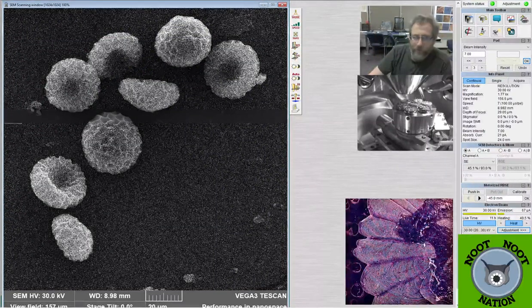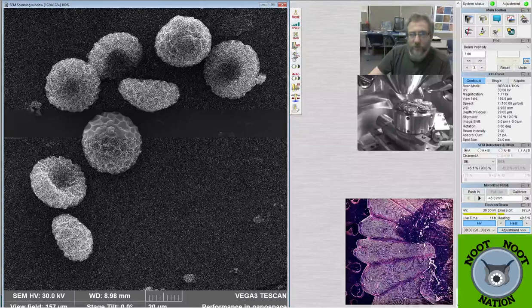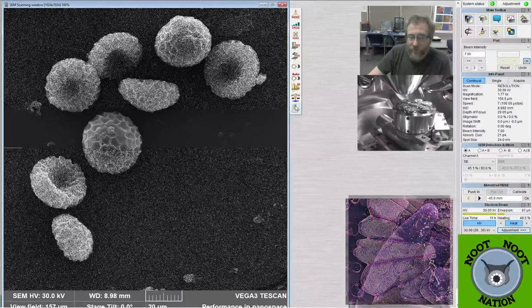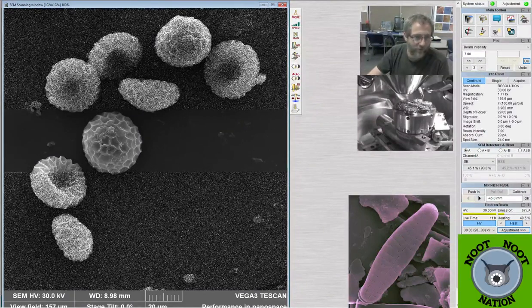For diatoms, I usually operate at like 5 or 4. I get a little closer because I need to see more of the micro ultra structures. I guess I don't need to, I just like to. I can, so I do. In any case, this image has a depth of field or depth of focus of about 30 microns. So everything will be in focus in this image. I don't have to make a choice.